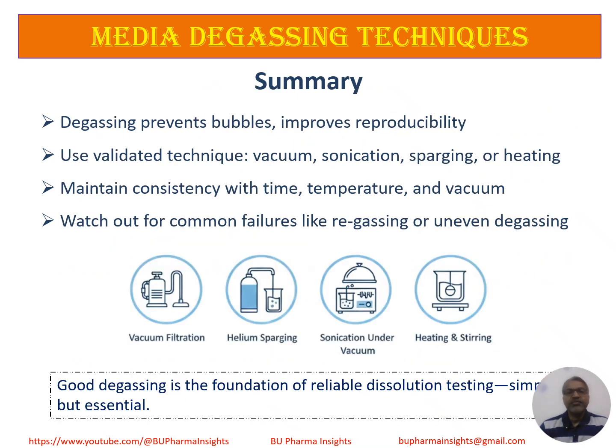Good degassing is the foundation of reliable dissolution testing. It's simple but absolutely essential. Proper degassing prevents air bubbles, improves reproducibility, and reduces variability. Always use a validated technique, whether vacuum filtration, sonication, helium sparging, or controlled heating, and maintain consistent time, temperature, and vacuum. Watch out for common failures like regassing or uneven degassing, which can silently compromise results. Remember, degassing directly impacts product quality, risk mitigation, and regulatory confidence.